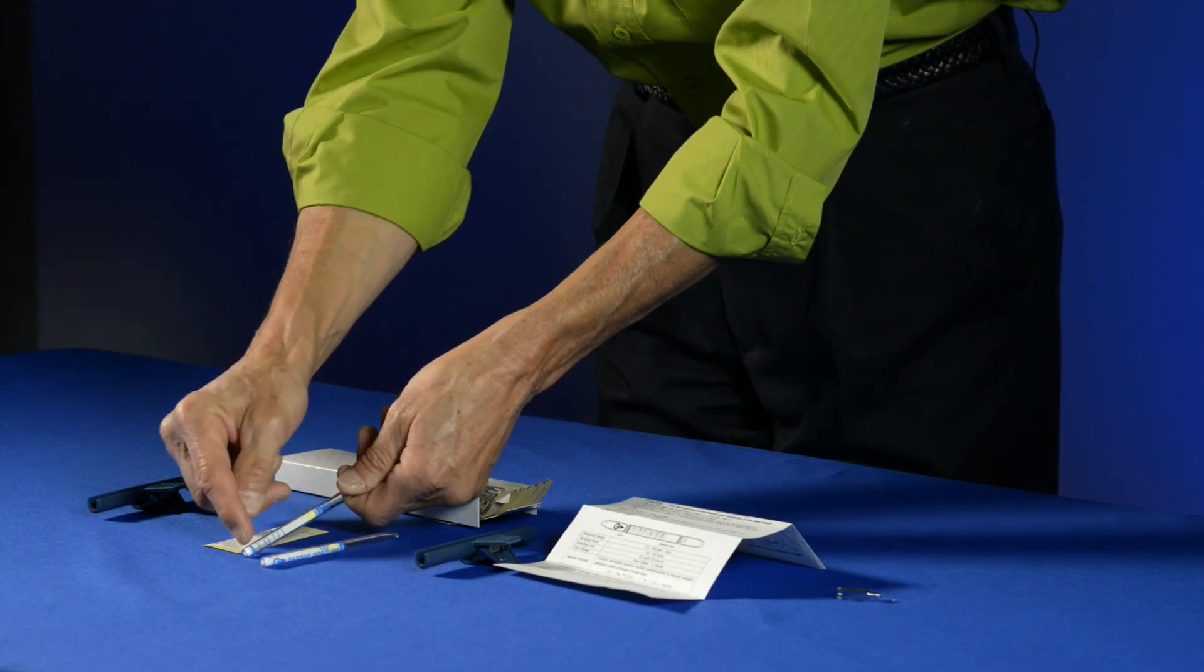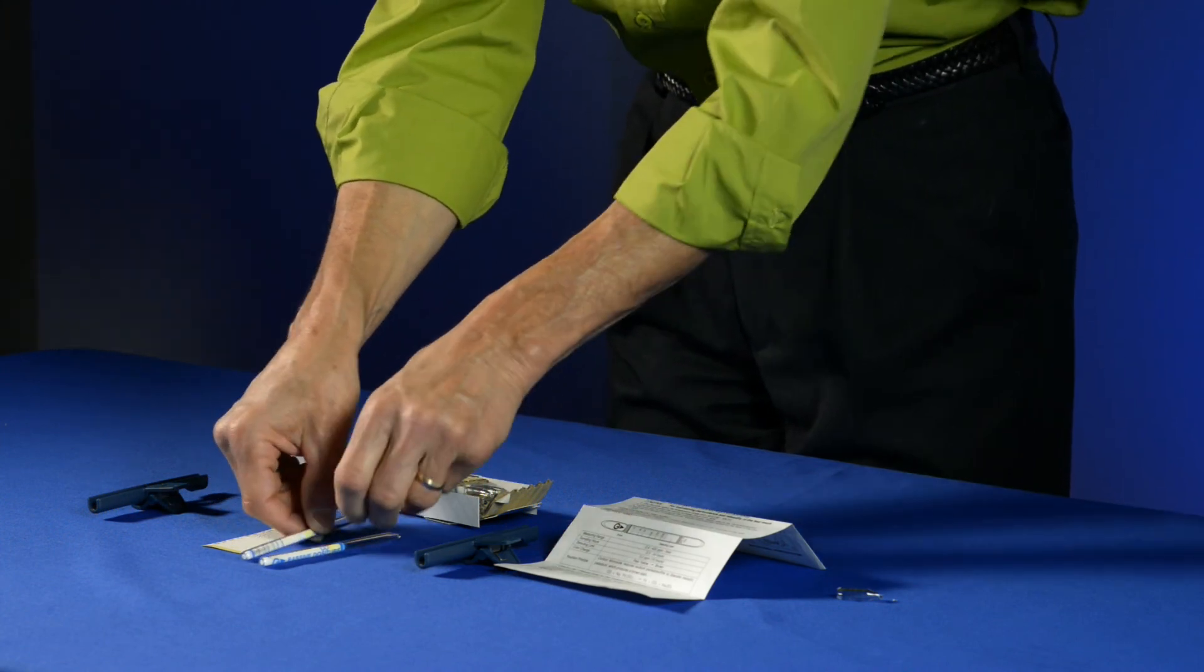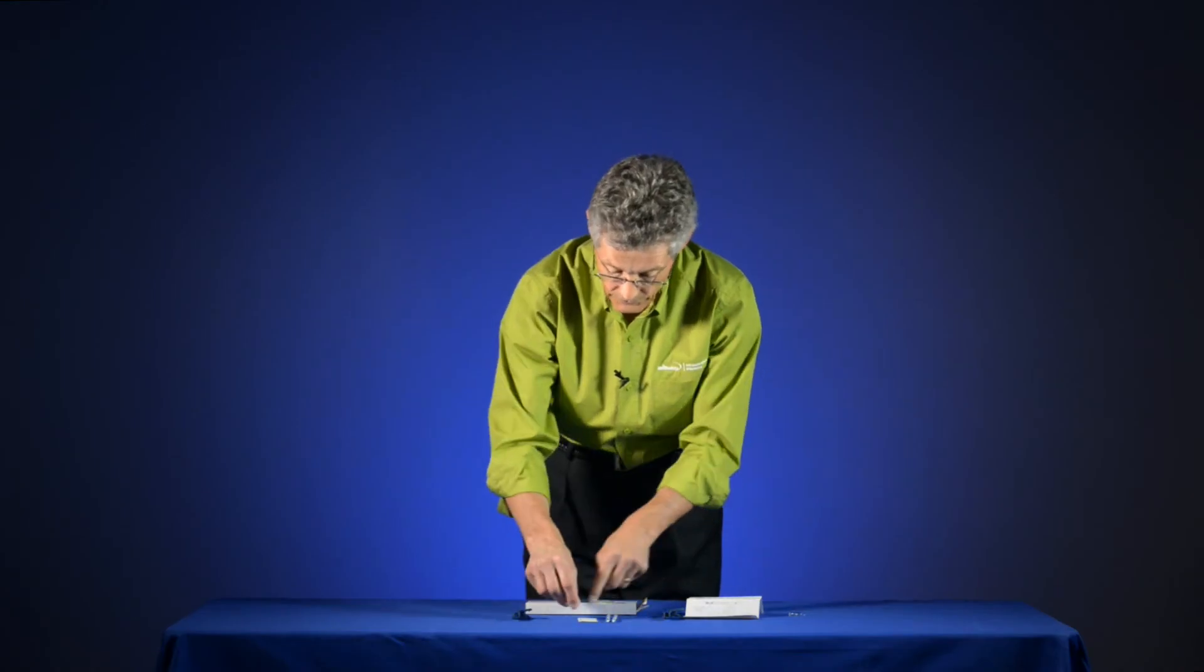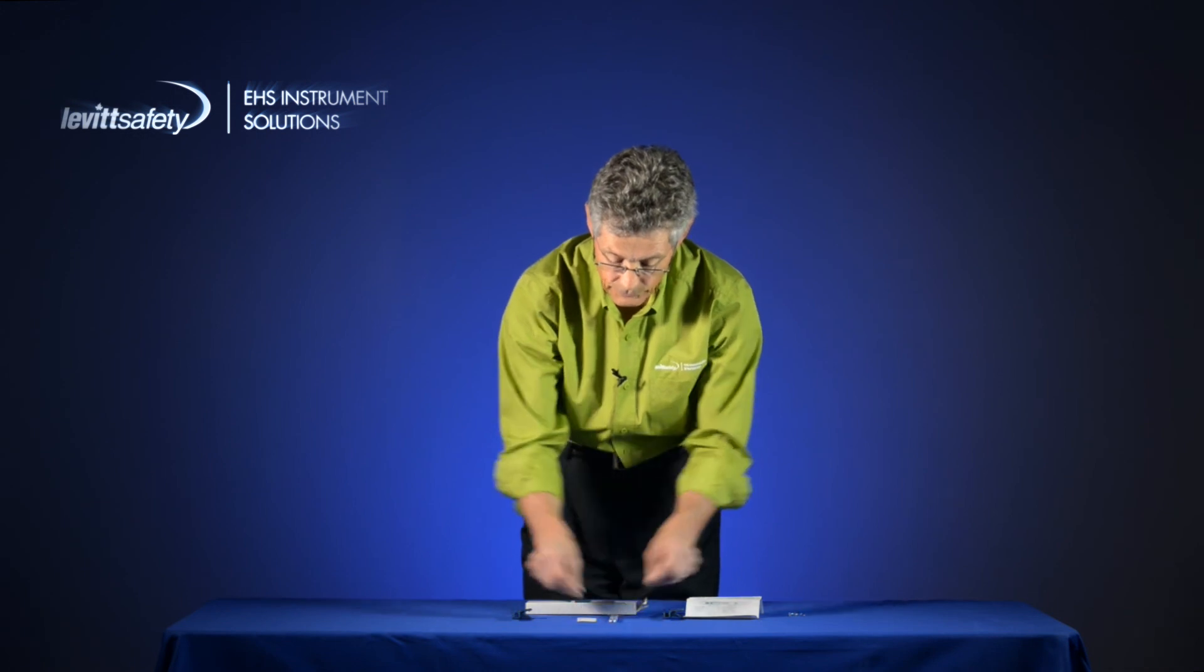So the graduation scale could go up to 200 ppm. Once you go past 200, of course it's outside of the measuring range of the device. Once you record that value, you can actually write it onto this card and then you keep a record of your results.